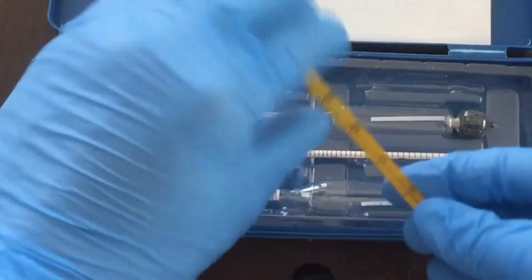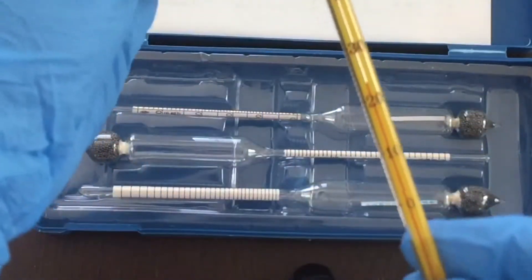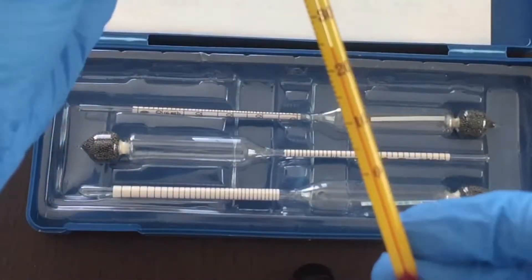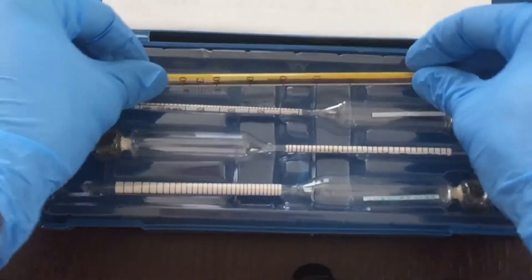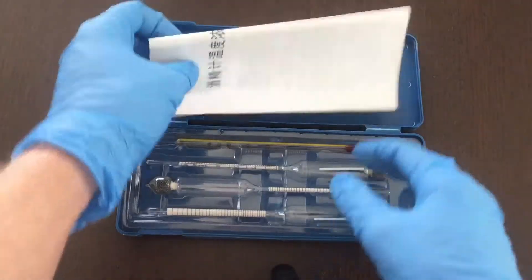It also comes with this mercury glass thermometer because the specific gravity, the concentration of the ethanol depends on the temperature.